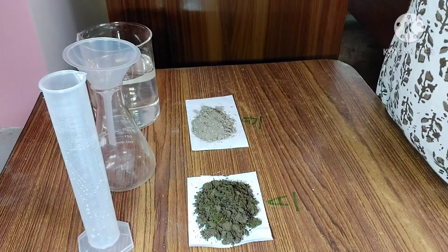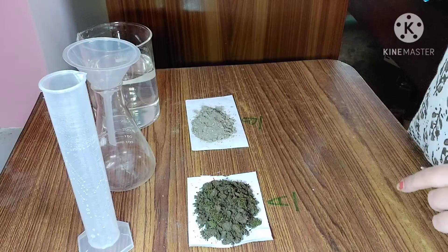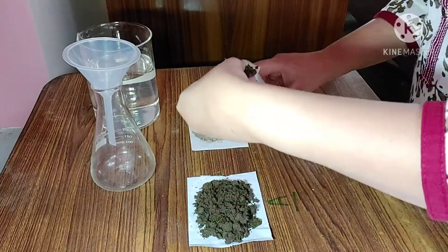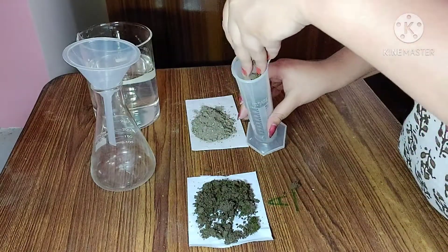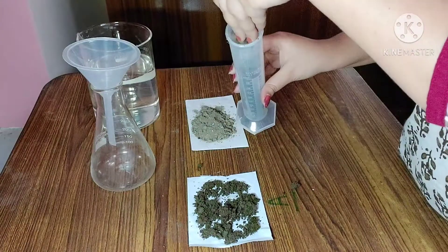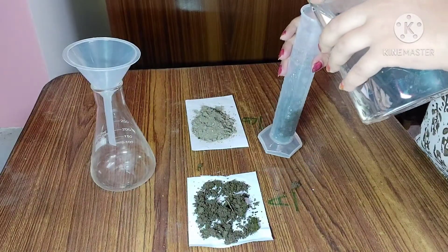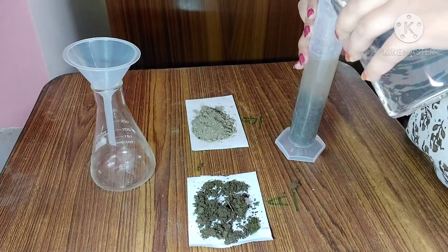Now I am going to perform the soil profile practical. For this, I will first take a measuring cylinder and add some amount of soil sample into it. After that, we have to add water — here I am using 100 ml of water.